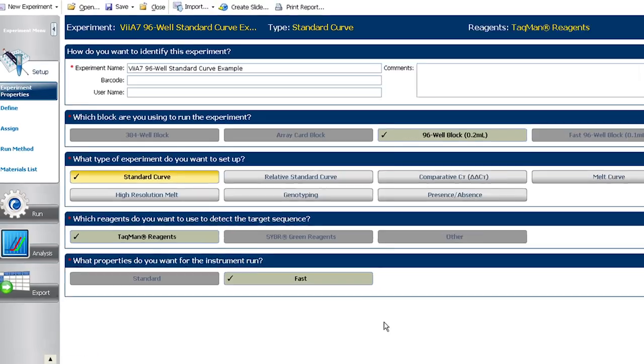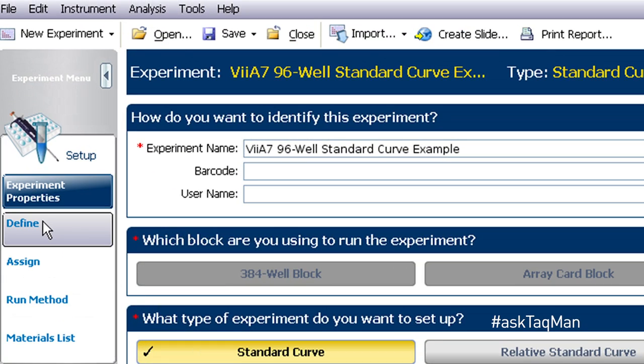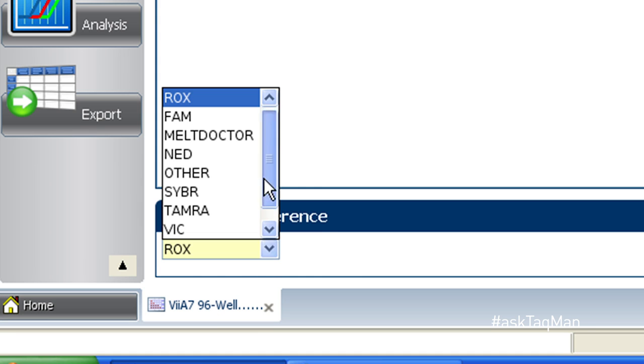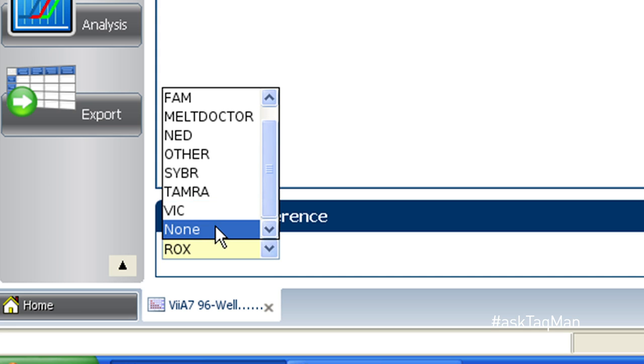Two key points about ROX. With a couple of specialized exceptions, the real-time master mixes from Life Technologies already contain an optimized level of ROX when they arrive at your door, so there's no need to add it. Second, the default in all Applied Biosystems real-time PCR software is to look for and normalize to ROX. This is important to know, because if for some reason you decide to use a master mix that doesn't contain ROX, you'll want to change the passive reference dye to none. Otherwise, the software will attempt to normalize to a dye that's not there — not a good thing.